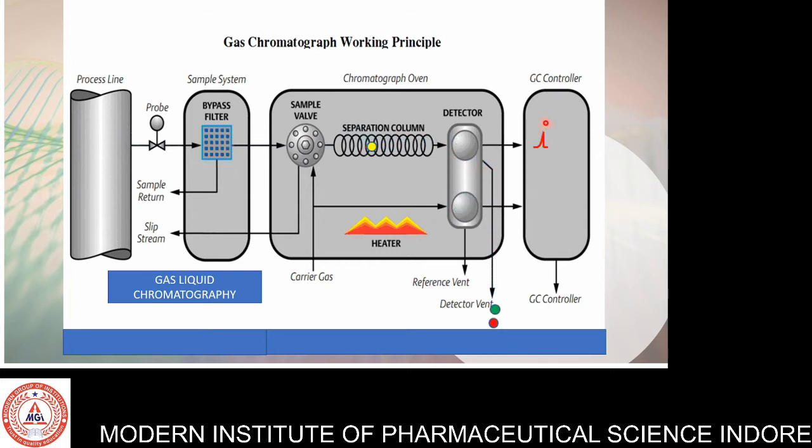Here the recorder is attached, which is the display of the gas chromatographic system. The recorder should generally be 10 mV full scale, fitted with a fast response pen, 1 second or less. The recorder should be connected with a series of good quality resistors across the input to attenuate large signals.